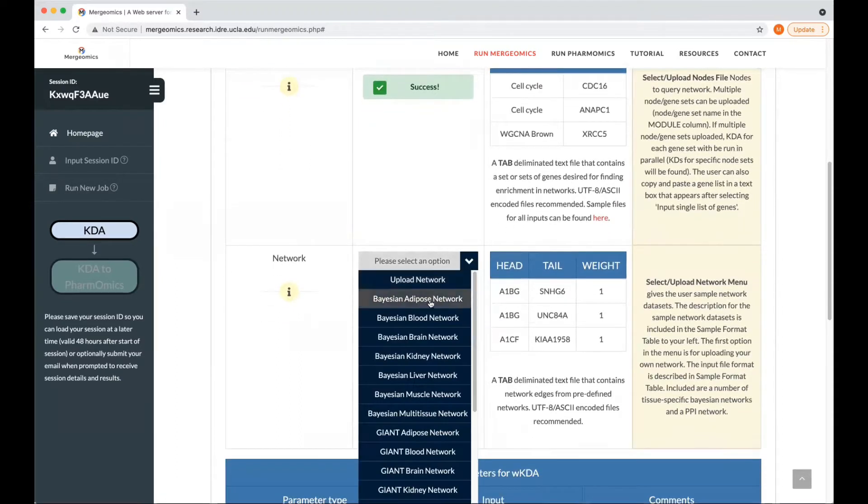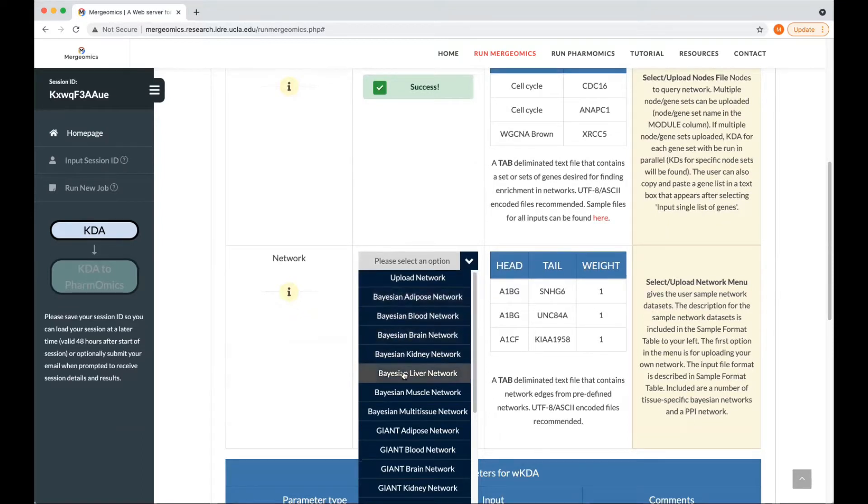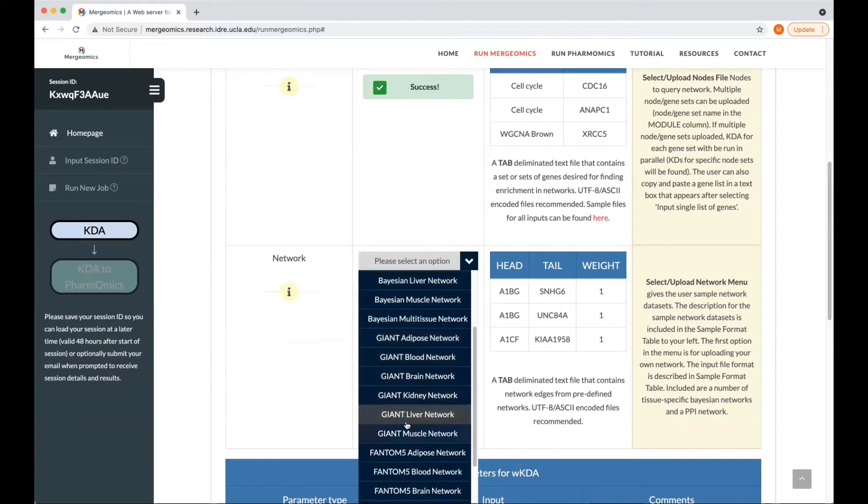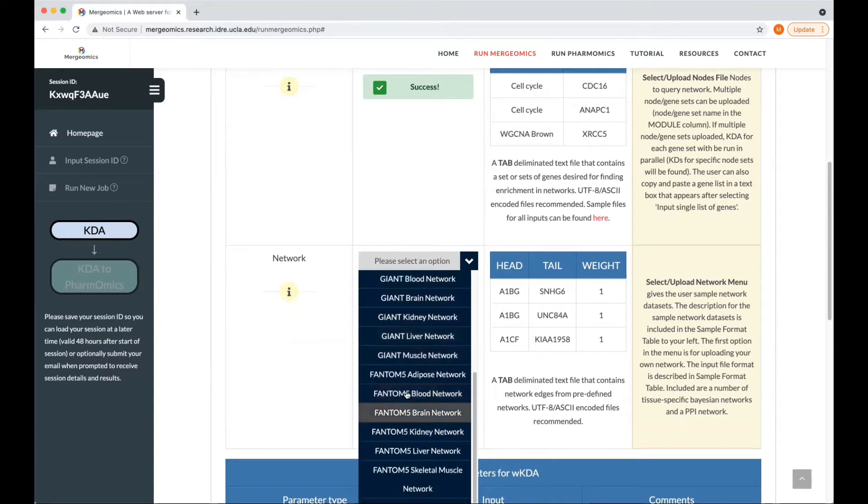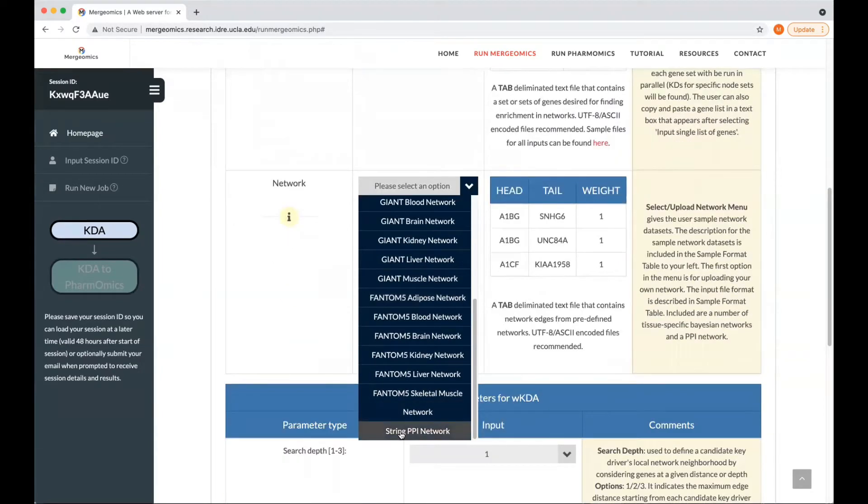Here we provide a long list of different networks that are tissue specific, where Bayesian are gene regulatory networks, GIAN are also gene regulatory networks, FANTOM5 are transcription factor networks, and finally, the string PPI network is a protein-protein interaction network, and we will utilize this for this example.